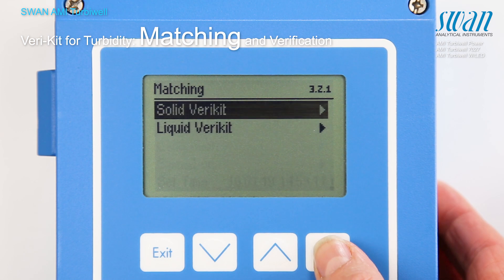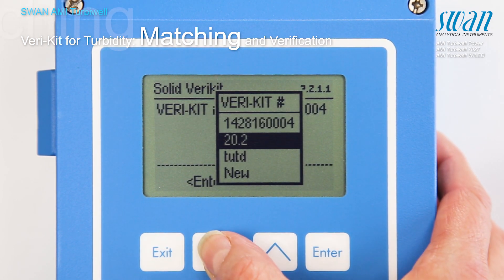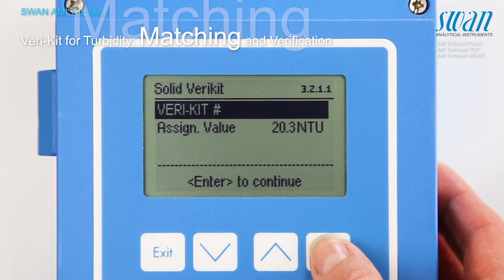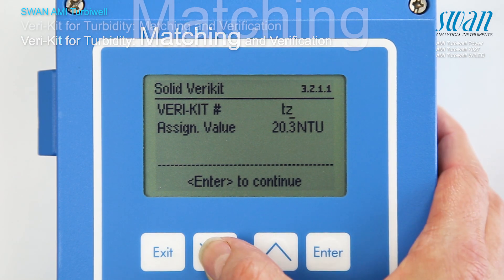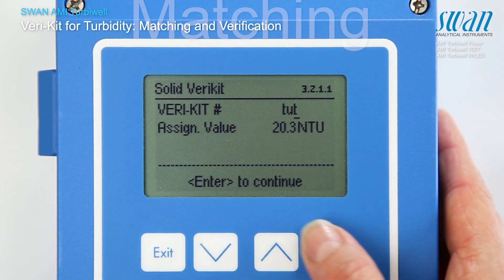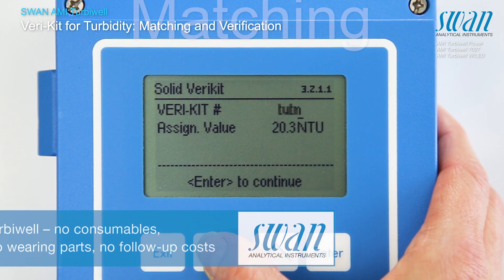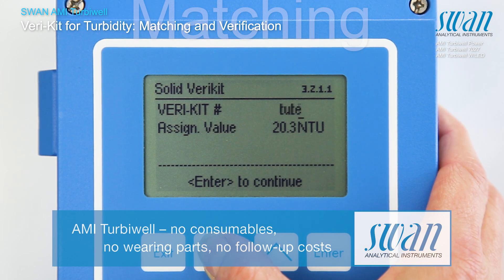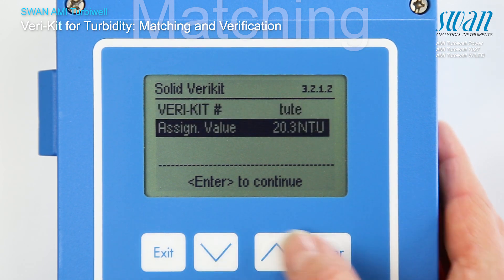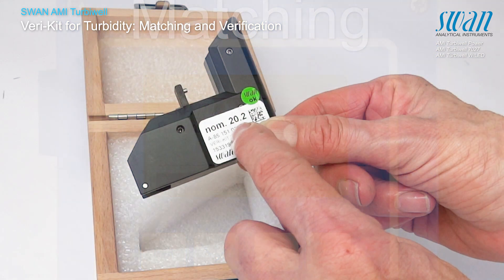The matching procedure is menu guided. In case a new varikit is to be matched, proceed as follows. Define a unique name for the varikit; there are 10 characters available. The assigned value is shown on the label of the varikit.